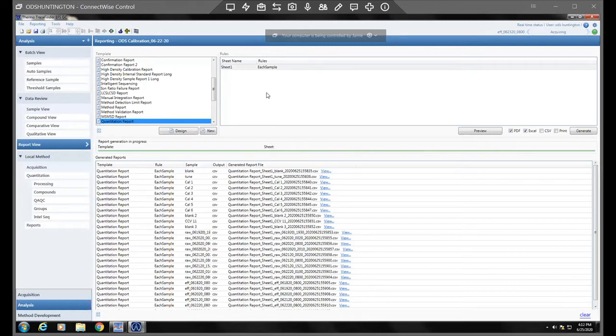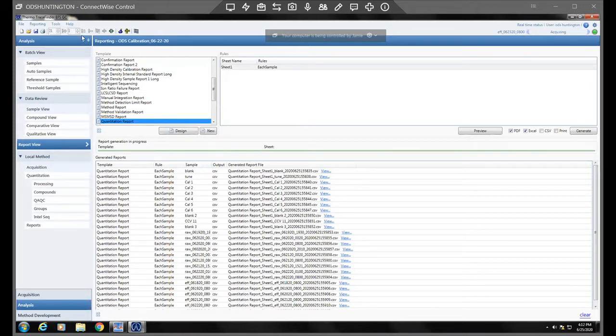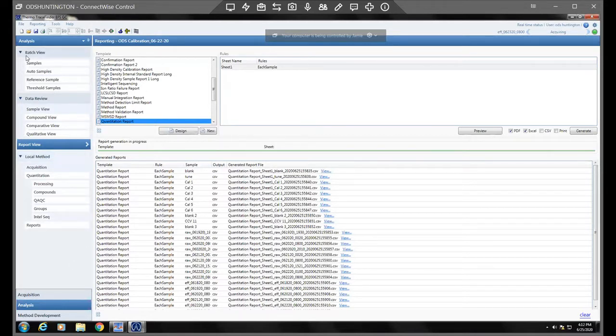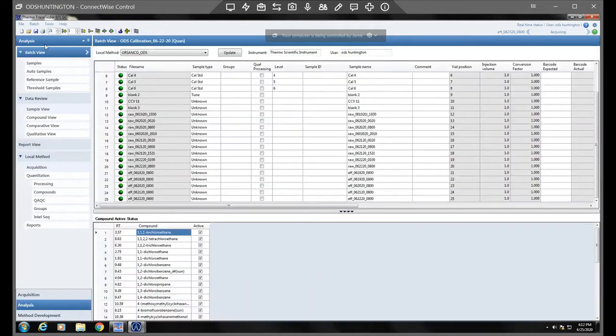I just wanted to show you how to look up unknown peaks with their spectra. We will go ahead and pull up anywhere on this analysis page, whether you're in batch view or anywhere.